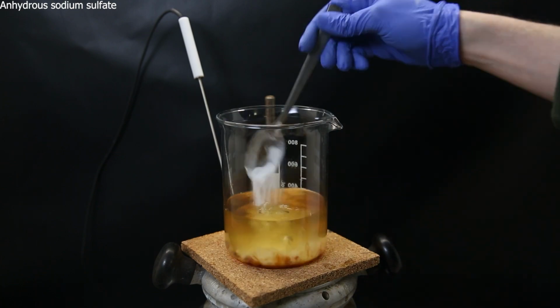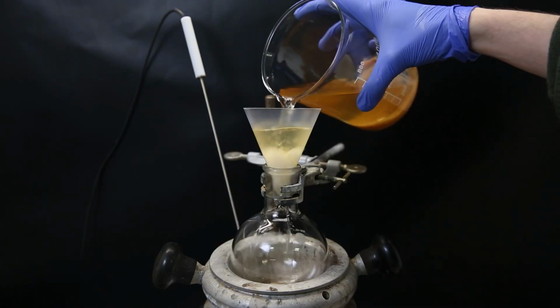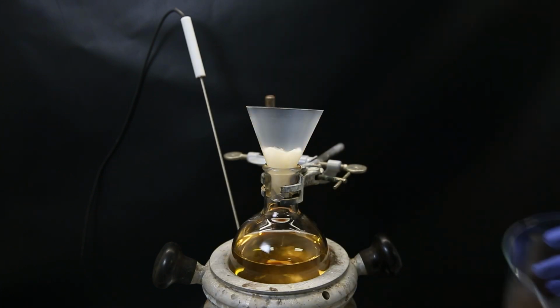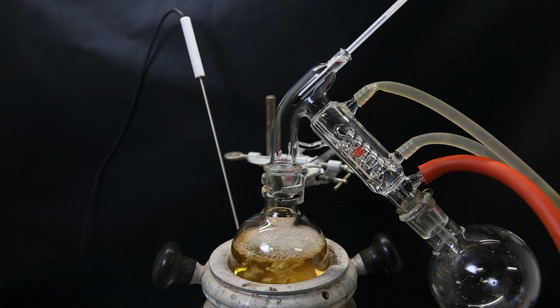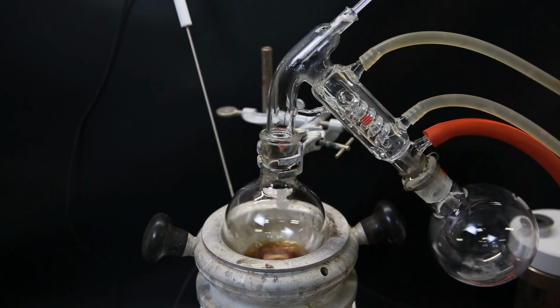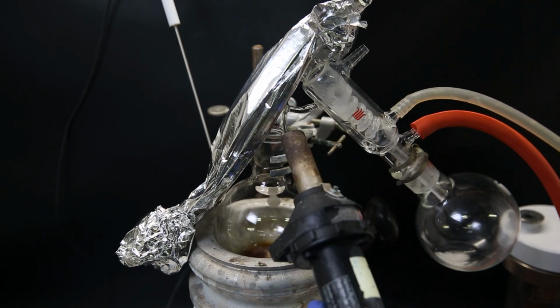So to absorb it all, I add a bunch of anhydrous sodium sulfate. I then filter it all through some cotton into a flask, and set the filtrate up for short path vacuum distillation. I first remove all of the pentane and acetone, and then swap the receiving flask. I start pulling a strong vacuum and increase heat to start distilling over the product. I insulate it with a bit of aluminum foil and assist the distillation with a heat gun.